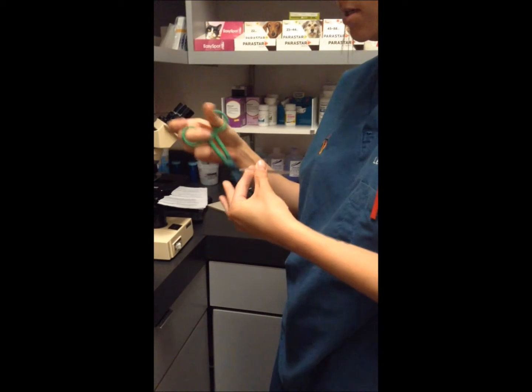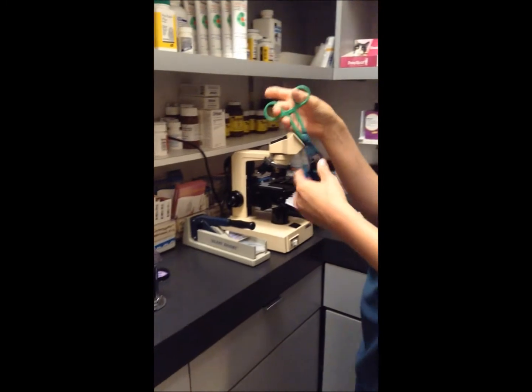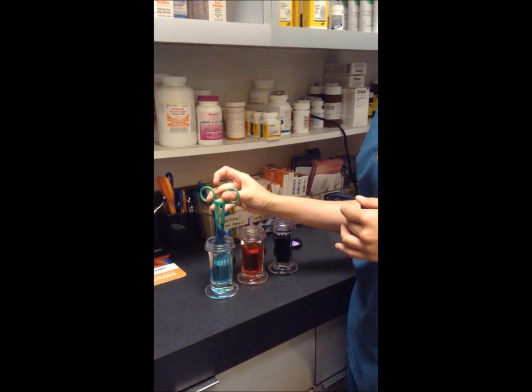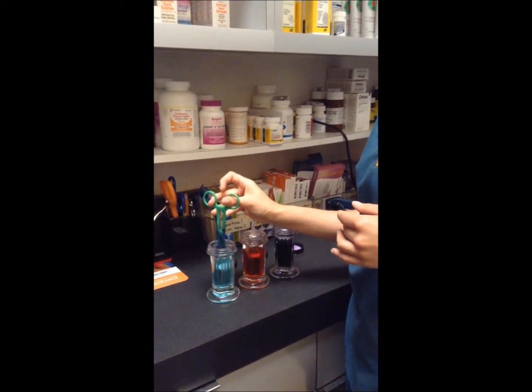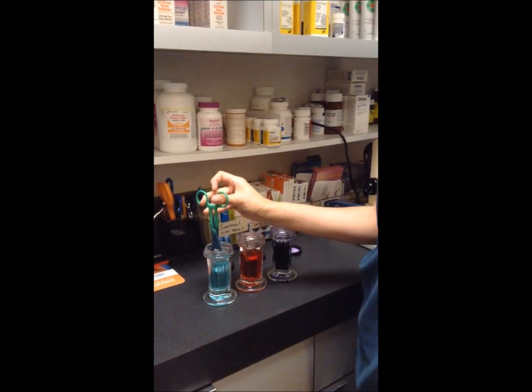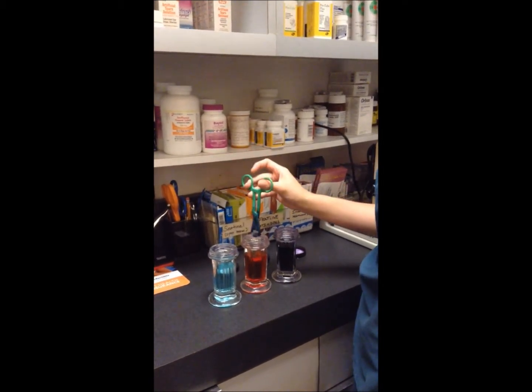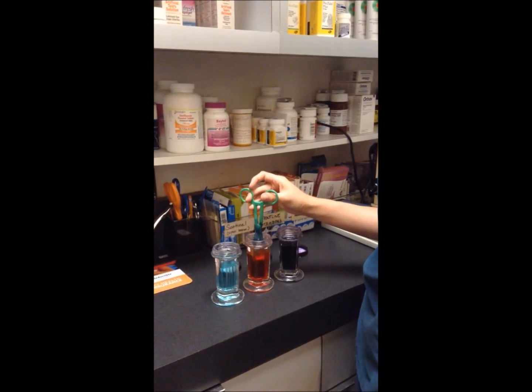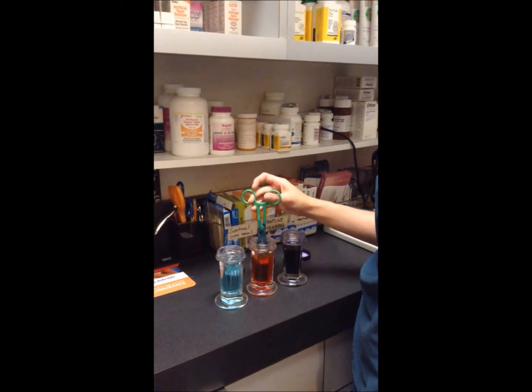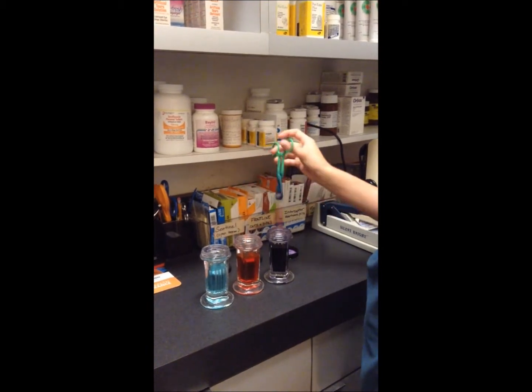Now we're going to go ahead and stain, and you leave the slide in each solution for about 10 seconds. The first one is the fixative. And then we have the stain solution. The counter stain solution.